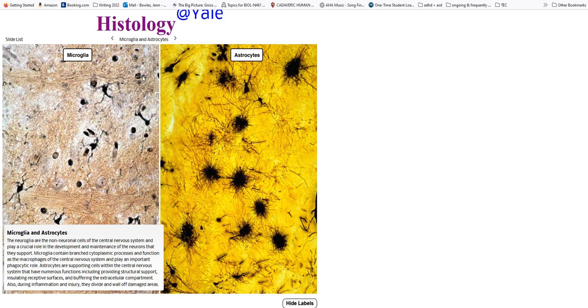Lastly, before we get to the spinal cord, I want to cover microglia and astrocytes. So these guys are not emphasized. I want you to be able to identify glial cells, those support cells, on a slide. And this is going to be maybe PowerPoint candidate questions, but not something I would expect you to identify under a microscope. So microglia and astrocytes are kind of non-neuronal cells. They're going to help maintain and support our nervous system.